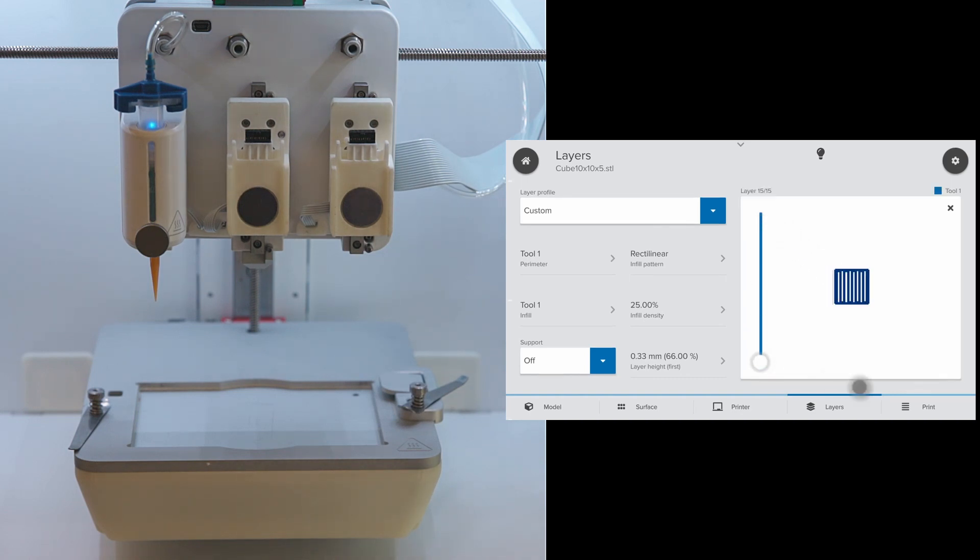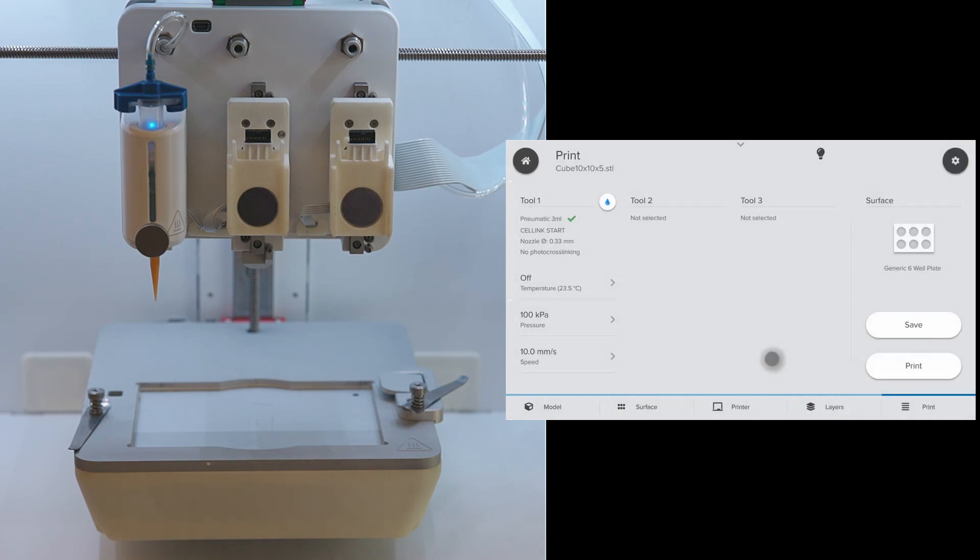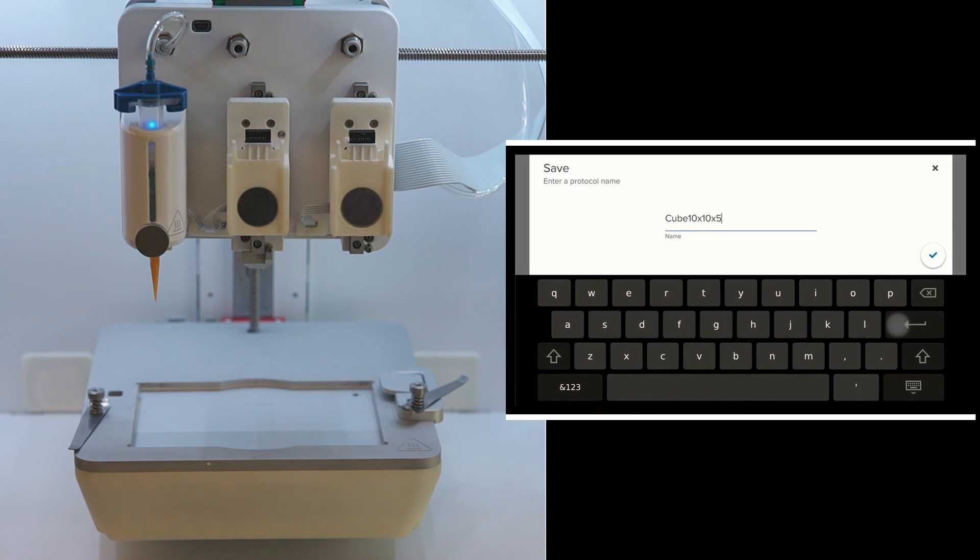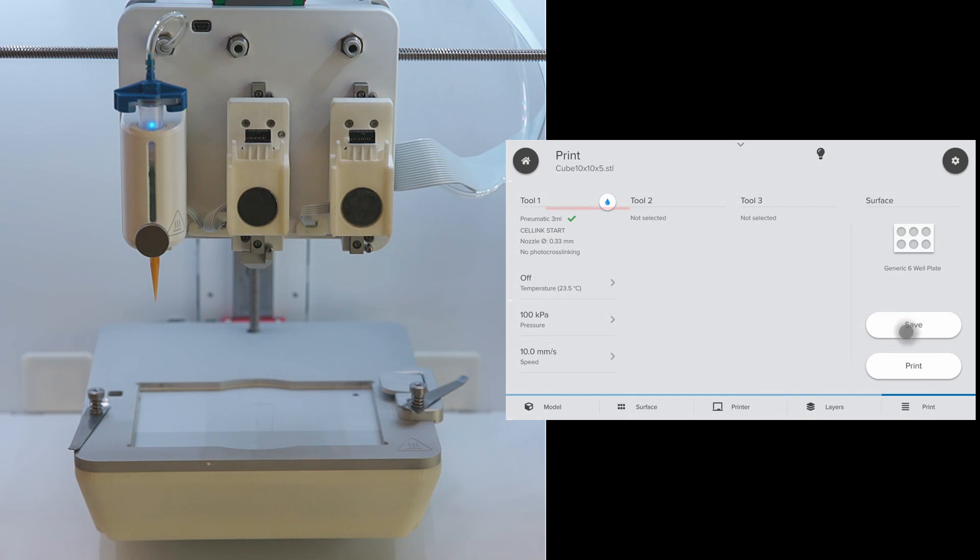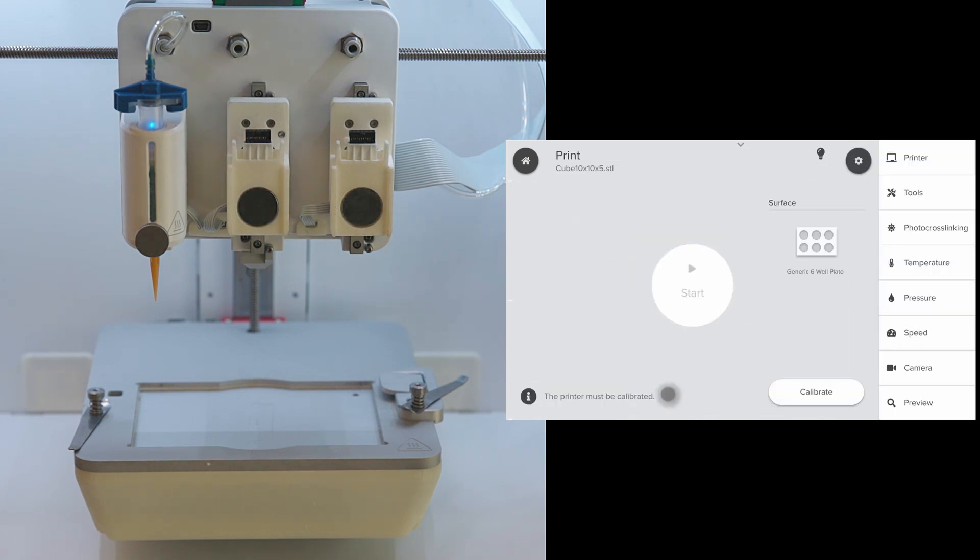Next is the print menu. We can save the print file and rename it so that we can find it later. This will save all the printing parameters including the 3D model, print surface, nozzle diameter, extrusion pressure, print speed, infill pattern, etc. Here is a summary of the printing parameters and we can click print to start printing.